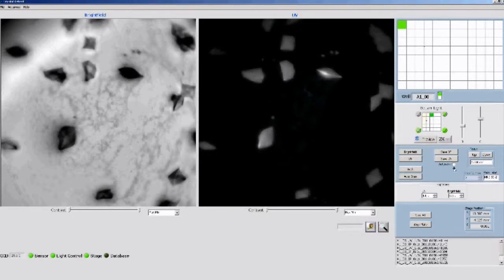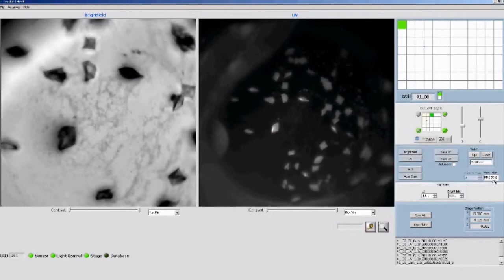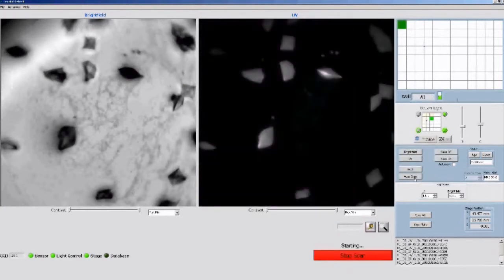The UI also allows the user to vary the exposure times, set the illumination pattern — dark field, bright field, or a combination thereof — and it also allows the user to measure the length of features that are of interest.